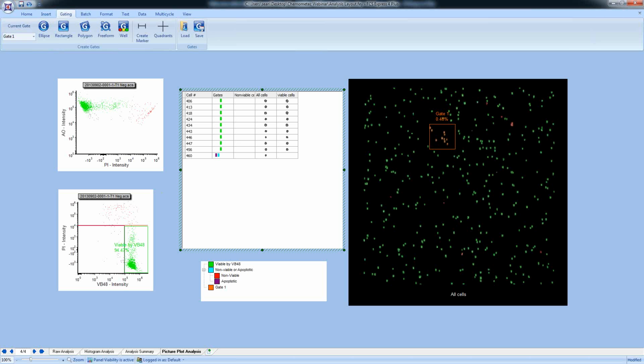And we had a question that says, are the images in columns 3 to 5 identical to the cells in the microscope image on the right? So are the images that fall in this data grid or this cell gallery the same as the images on the right? They actually are. These images are derived directly from this picture plot, directly from the images taken on the microscope.